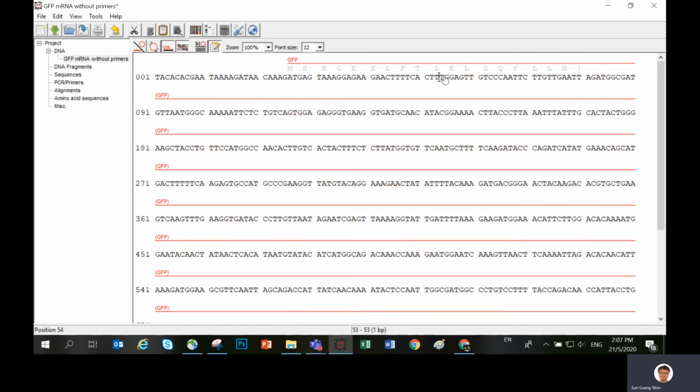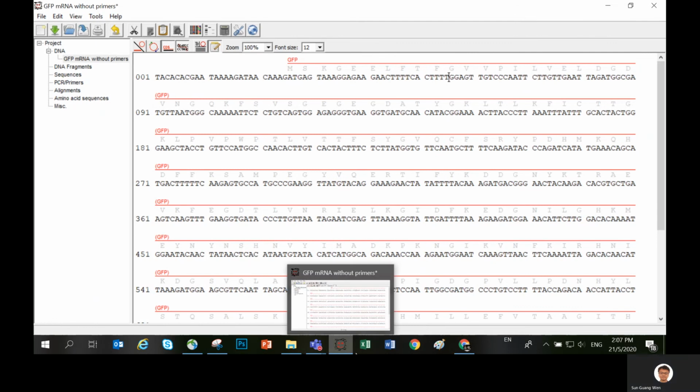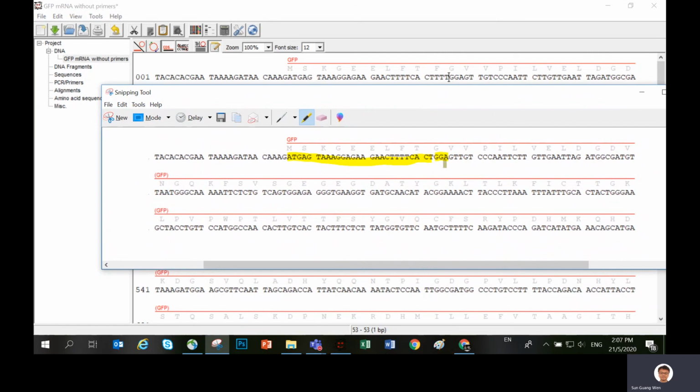If we insert one additional nucleotide, so in total I insert three nucleotides, three nucleotides will form a codon by themselves. Let's see what's the consequence. Again, the insertion site is before this GGA. So now the TTT inserted forms a new codon, which codes for F, phenylalanine. Then the original codon GGA is still intact.